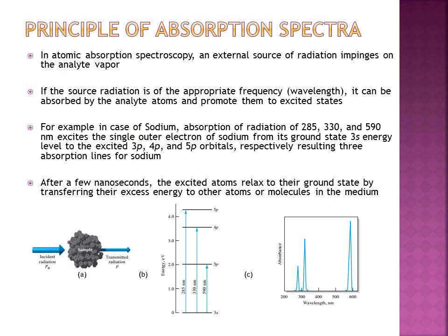So there will be resulting 3 absorption lines. You can see at the position of 285, 330 and 590. Means sodium has absorbed these 3 radiations of wavelength which I mentioned here. Then after a few nanoseconds, because the excited state is a temporary state, atoms relax to their ground state by transferring their excess energy to other atoms or molecules present in the medium.